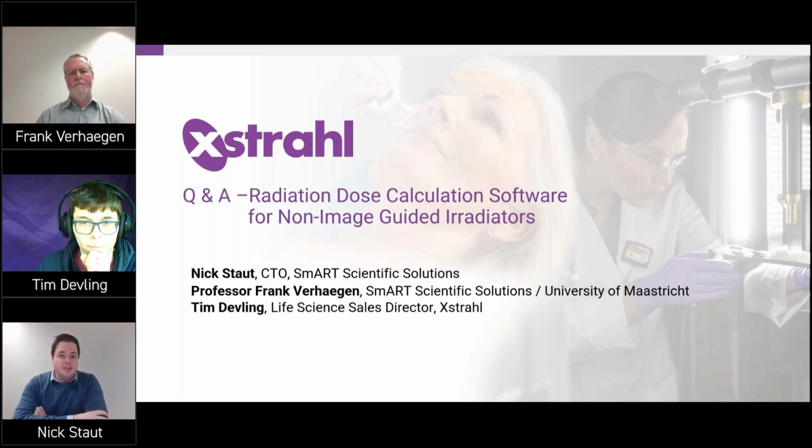We don't have a machine yet, but back in the presentation there was Zhang et al. who had a paper that said around 30% difference for a homogeneous mouse. So I would assume that it's probably even more. Okay, so it could be quite large. Could be quite large, and it's also dependent on what you're interested in. Is it the dose to the bone, or is it the dose to soft tissue, and where is this located?